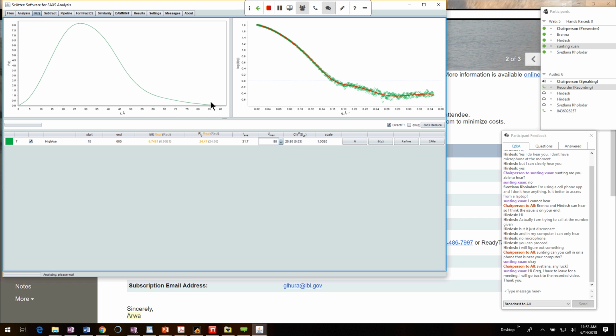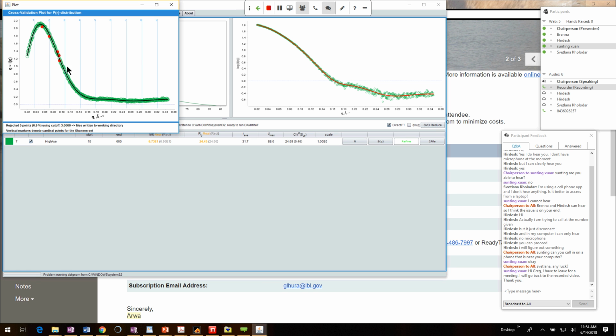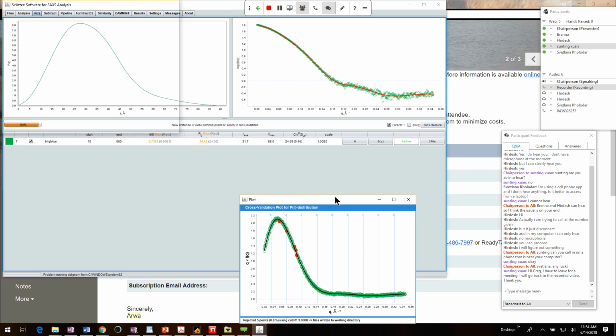And this is probably those first 20 amino acids that are unfolded and sticking out of the protein, and then you have this sort of globular region. Because there's a little tiny shoulder here, it's hard to see, but I can see that it's a little not Gaussian. This probably means it's a flattish object. You can also use this refine button, which gets rid of outliers, things that are noise for the P of R function, and sometimes changes it. So that's the P of R function.